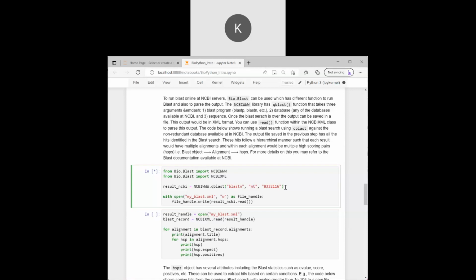Instead of doing that, there is another option in BLAST. If you have seen, you can specify two sequences so that you can do it from BLAST2P or BLAST2N. If I replace this NT database with another GI ID, will it pick BLAST2N, or how will it do that comparison? First we need to check whether that BLAST2N part is supported or not. I'm not sure.